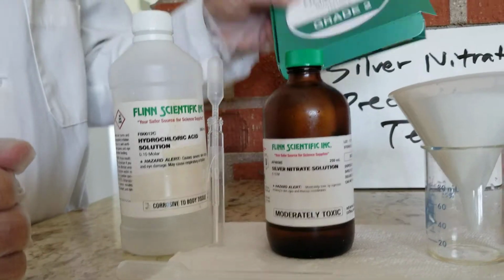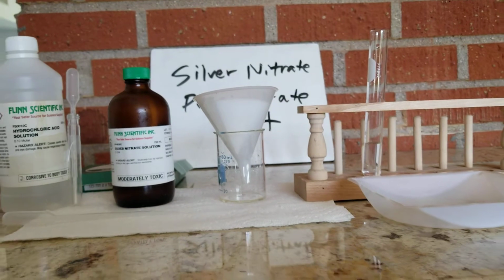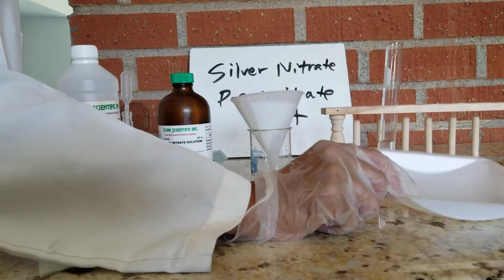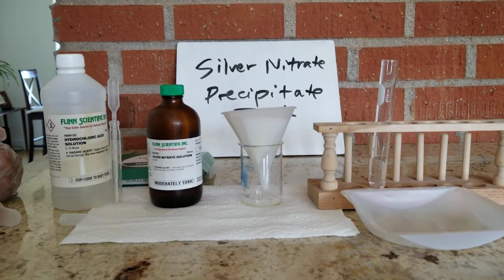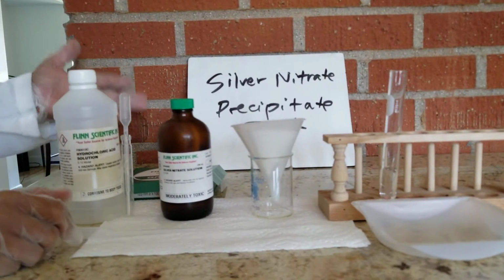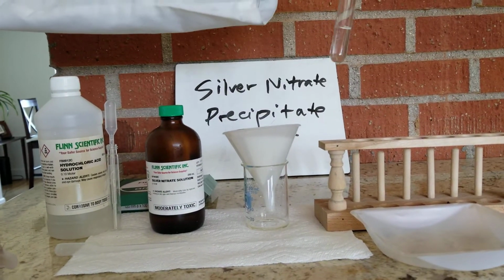We're using filter paper, a funnel, a small beaker, a test tube holder, and we will also use a little container. It doesn't have to be a weighboat, but just something to hold the filter paper. The second part of this demonstration, we're going to go outside. So let's get started. I've pre-measured our hydrochloric acid, about 3 milliliters.